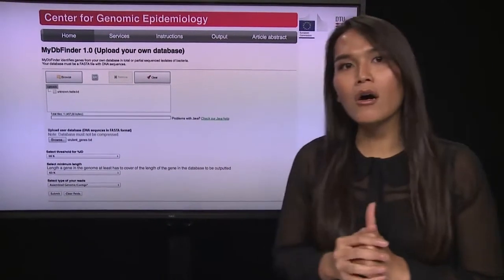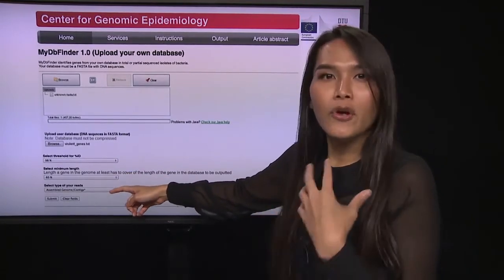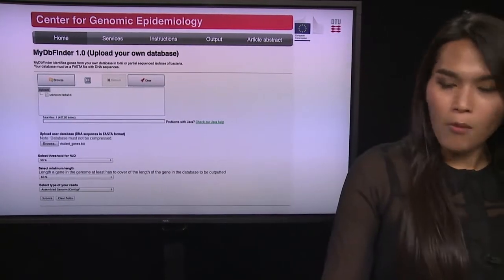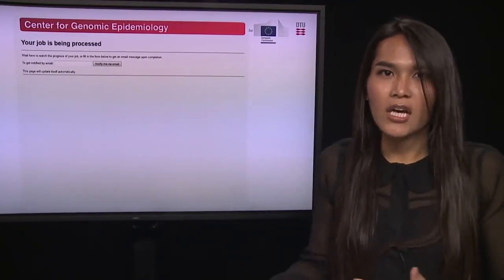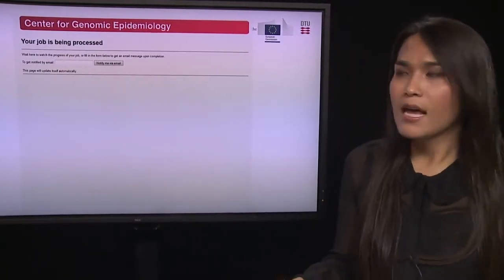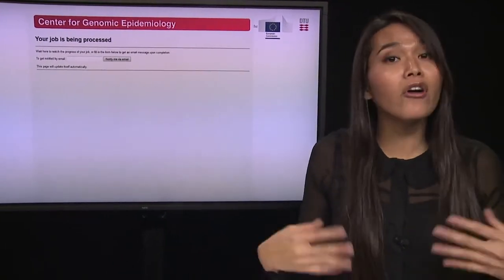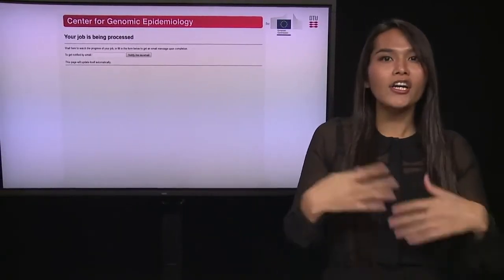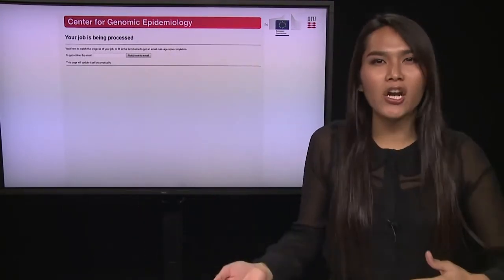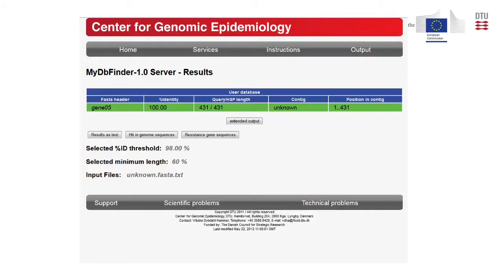Once you have browsed your unknown genome, uploaded your database, chosen all the options, and selected the correct data type, you are ready to submit your job by clicking 'Submit.' This leads you to another page that shows whether your job is being processed. You can also enter your email and click 'Notify Me via Email' — once your job is done the program will send you the output link. You can start another submission right away without waiting.